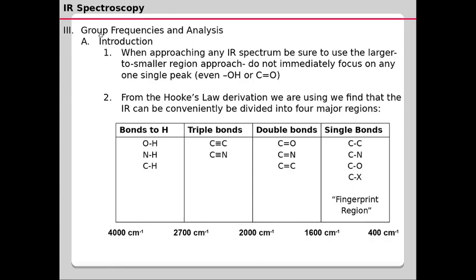Okay, welcome back to the IR spectroscopy class. In this class, we are going to start discussing the vibrational frequencies of certain functional groups as well as the vibrational frequencies of bonds that make up the overall molecular structure, or the overall molecular skeleton. So we call this group frequency analysis.